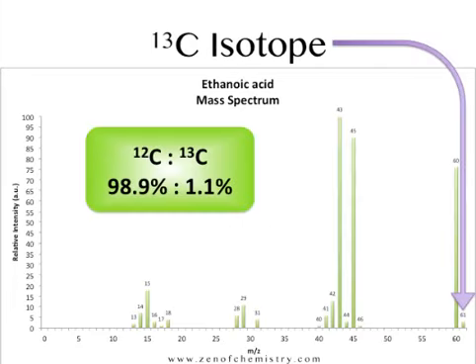Lucky last, I'm just going to point out again, this is our ethanoic acid. I just want to point out again our carbon-13 isotope down the bottom here.